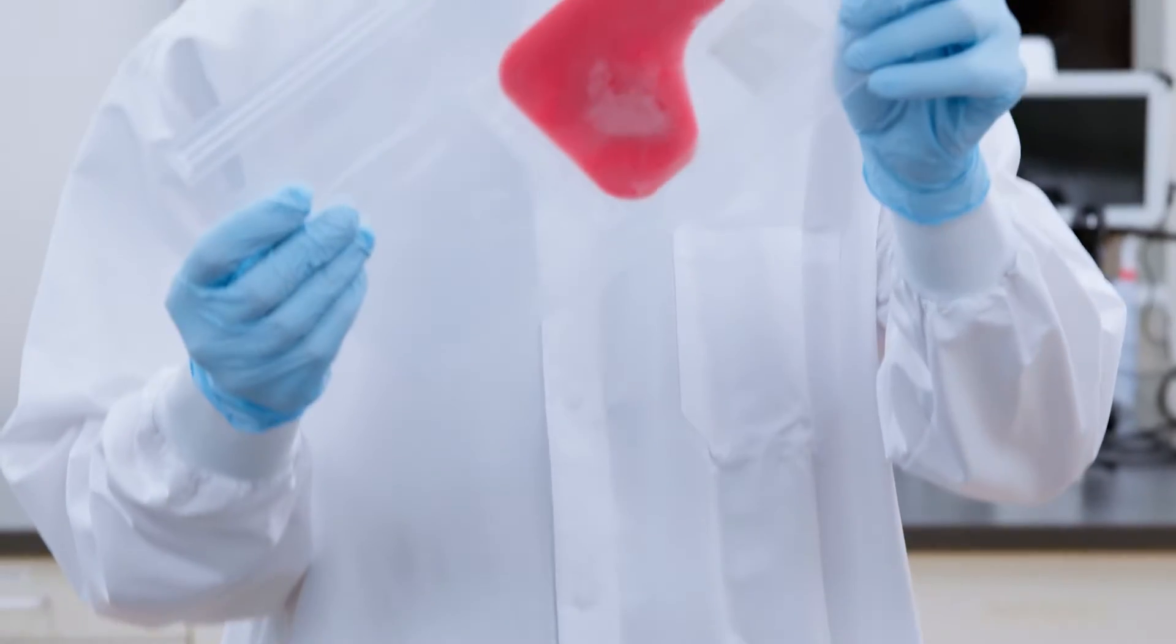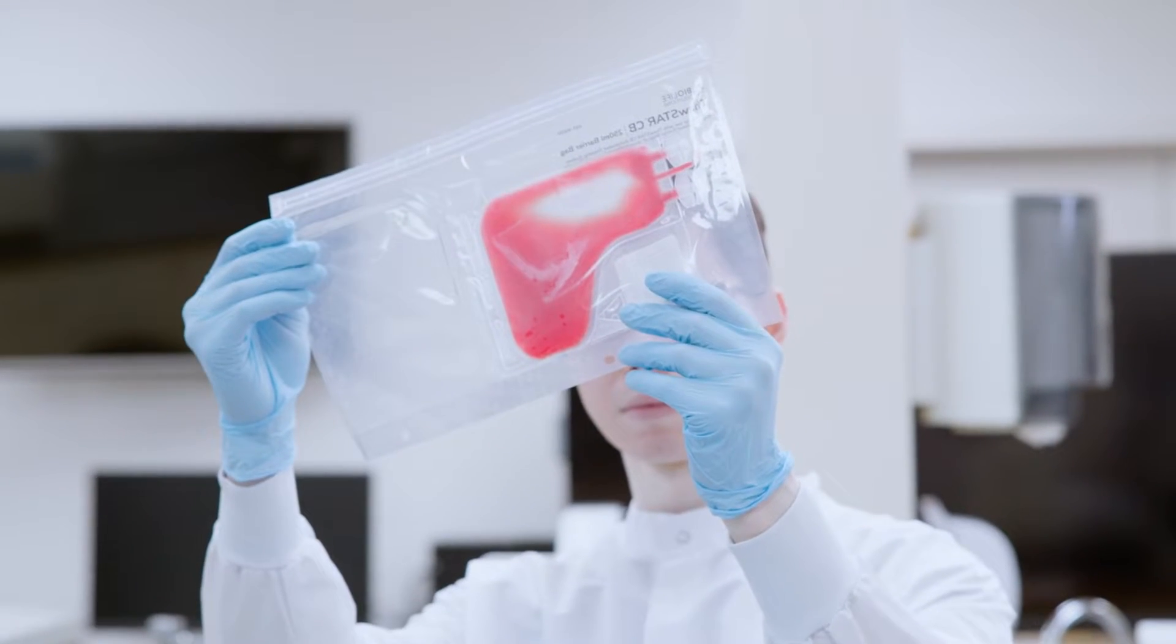Consistently thaw your frozen Leukopax or cryobags containing cells in just a few minutes using the Thawstar CB.